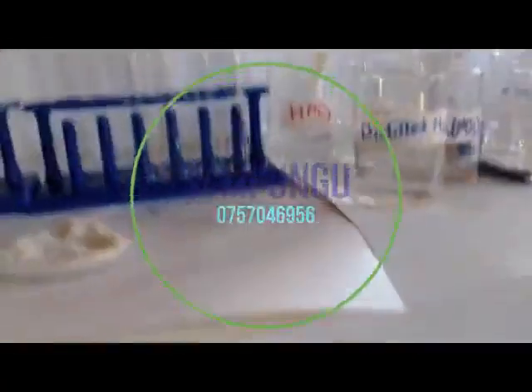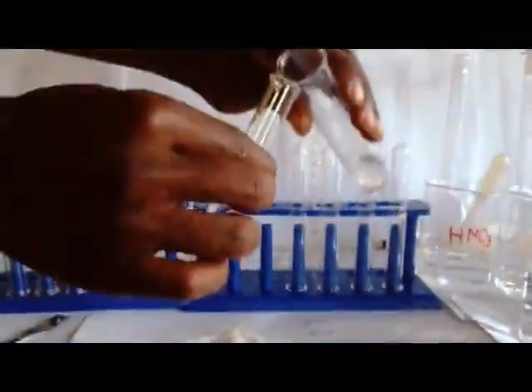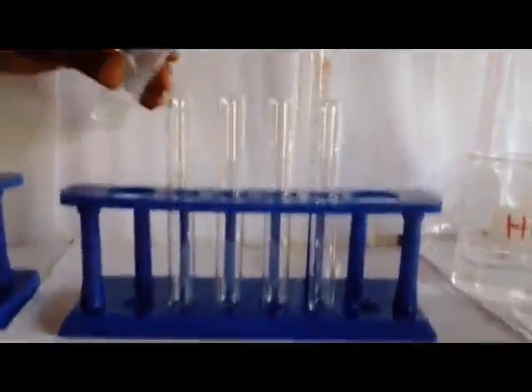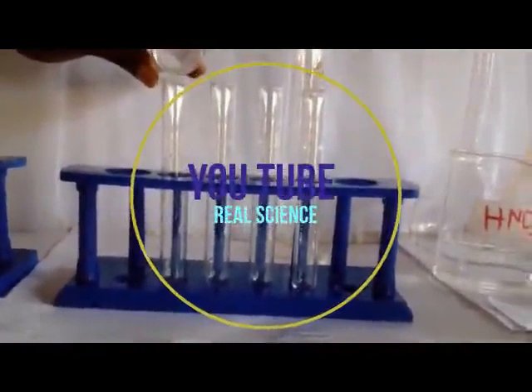Members, make sure the working apparatus you are using is clean to avoid getting wrong results, and make sure you always use a little sample. When you use a lot, that one is a wastage and does not give you the correct results.